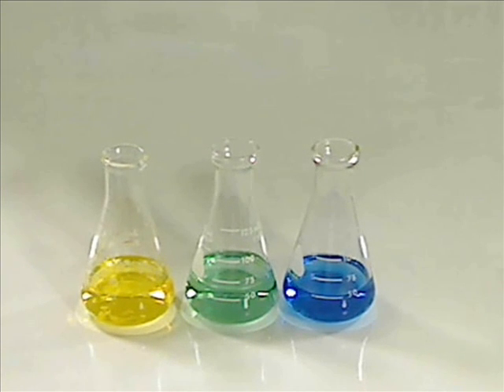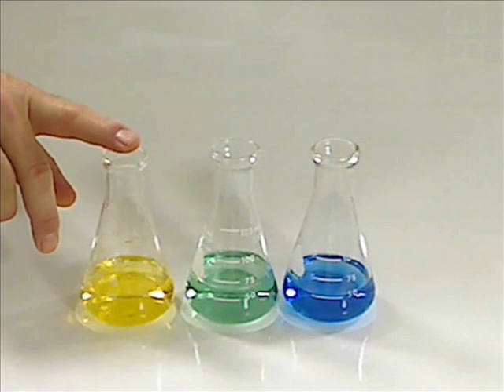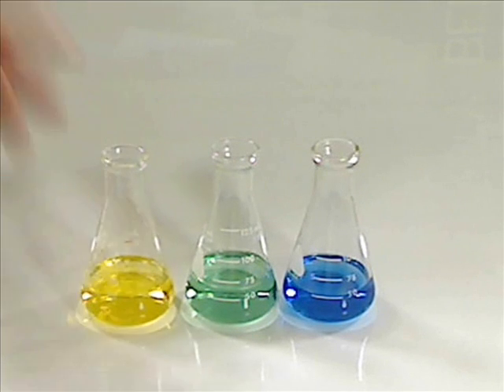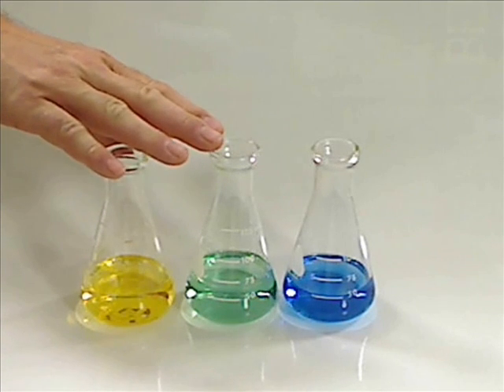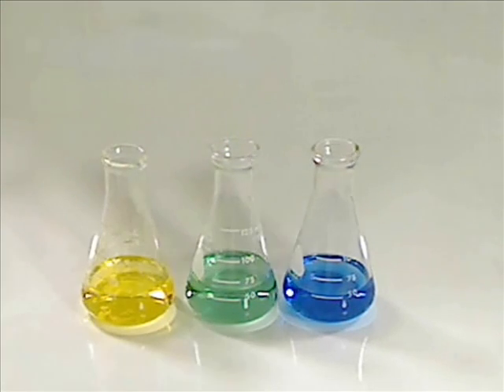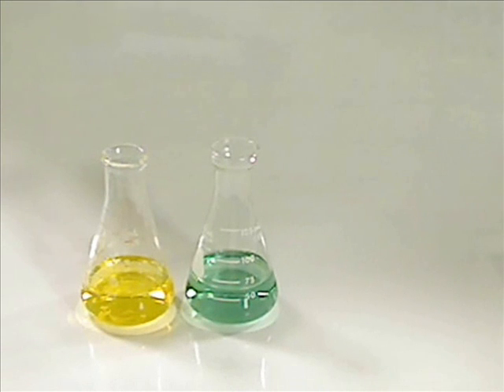And during a titration, if you have the acid in the Erlenmeyer flask and you're titrating with a base, you're going to start with a yellow and you want to go towards more of a green for the equivalence point. And let me demonstrate how that would work.